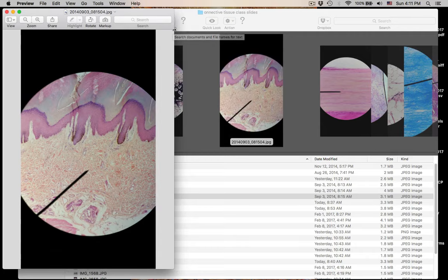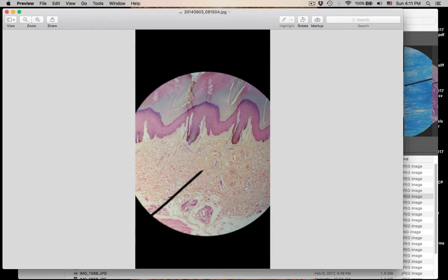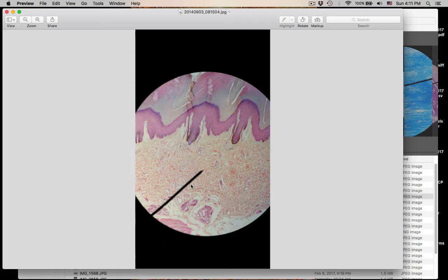This is dense irregular connective tissue. You can tell this is skin. The upper 20% of skin is going to be areolar connective tissue in the papillary region. This is in the reticular region of the dermis — the lower 80% of the dermis — and it has dense irregular connective tissue.